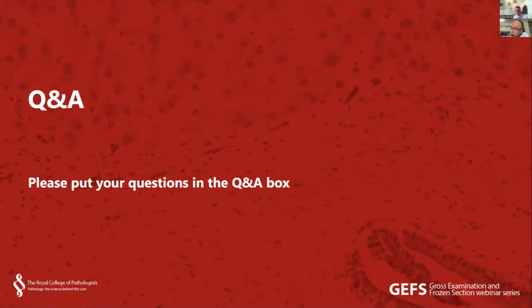There is a useful comment while you were discussing the key or block labels. One of the candidates has said that it is really very useful. I might add that we do get slides from patients operated on in different hospitals, and if your case is going to be reviewed by somebody else, the labeling key or the block labels are extremely useful. That's one of the very good comments. I agree. I do agree. Yeah.